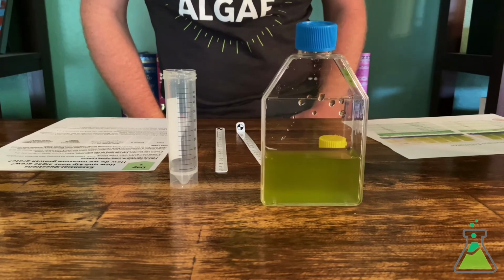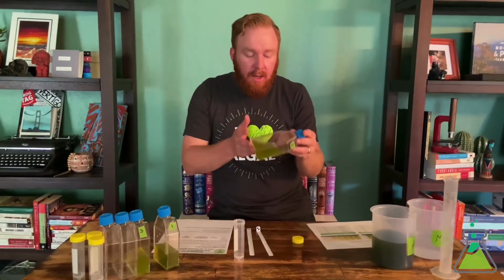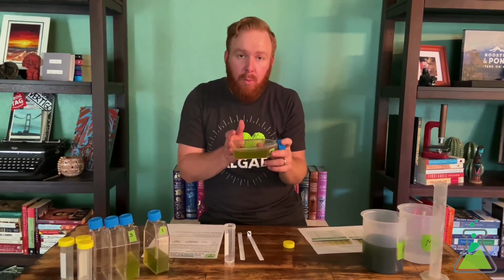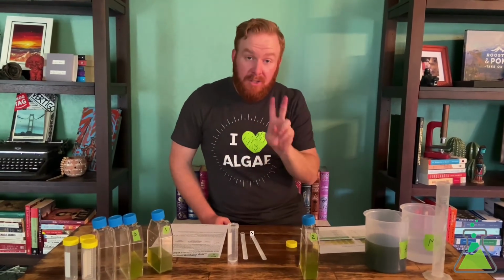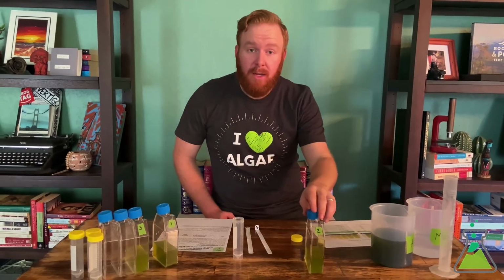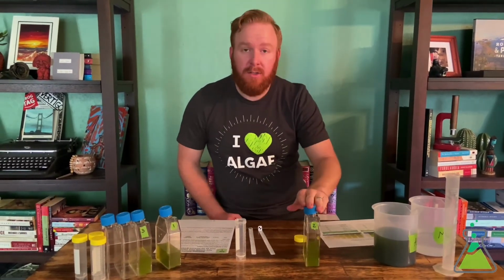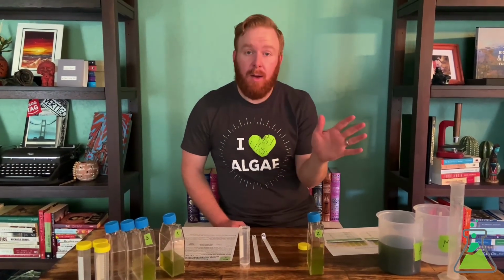All right, so what we're going to do is set our culture on a windowsill somewhere, give it a couple of days of light and a little bit of warmth from that solar radiation. And we're going to come back in 2 days, and we're going to measure our growth rate by measuring the biomass one more time using the exact same method we just did. And we're hoping that the algae is growing, so we'll have a little bit more biomass next time we come around. So I'll see you in a couple of days.